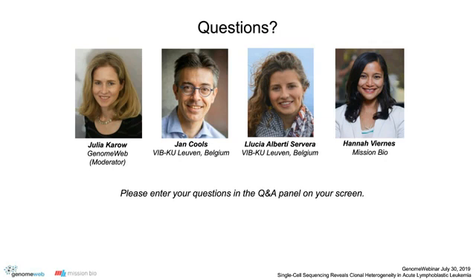Technical question for Hannah. Is this ALL panel currently available, or when will it become available? And also, what's the minimum number of samples that you need to use on the Tapestri? Great questions. So this ALL panel, you can get that today through our Tapestri Designer, through our custom offering, and we are planning on making it more available as a commercial panel in the Q4 timeframe. Okay, thank you.